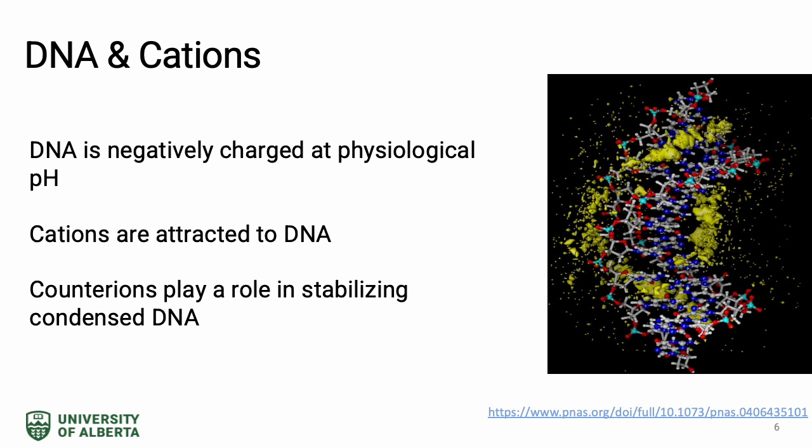Cations stabilize condensed DNA, providing electrostatic screening for the highly charged naked DNA, and even facilitate the attraction of like-charged DNA molecules under certain conditions.